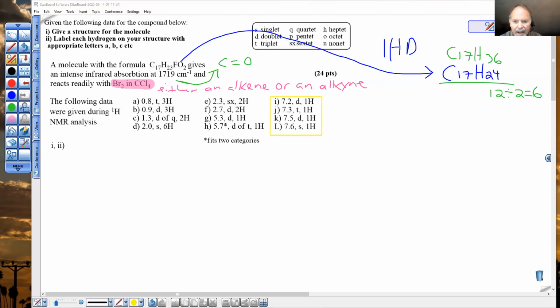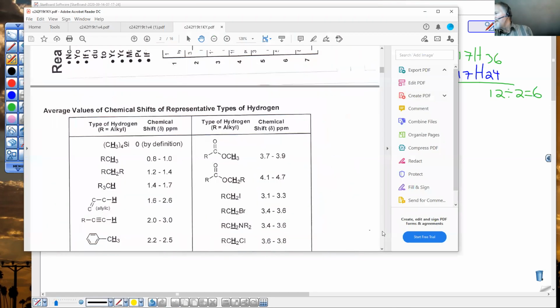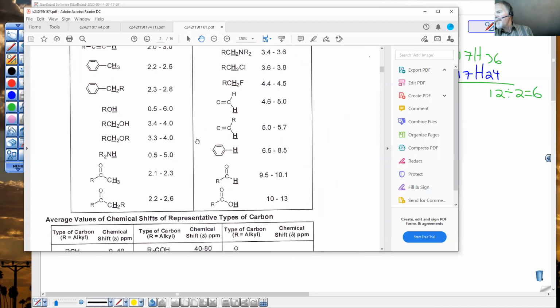I just forgot where I left it open, so I'll open it. No, I don't want that one. There you go. I'm going to look at the first page or the second page of a test. Yeah, I've got an answer key here, but that doesn't change it. It's the second page. And we see on the second page that we have benzene, typically 6.5 to 8.5, but a normal benzene's right at 7.1. So if you see peaks near 7.1, that's what immediately you start thinking of, benzene.